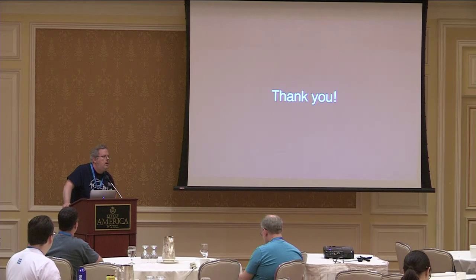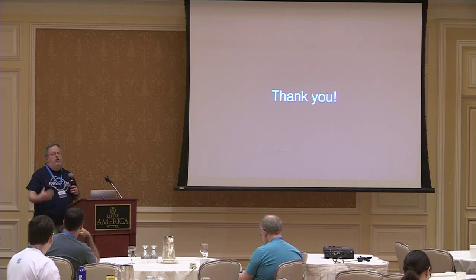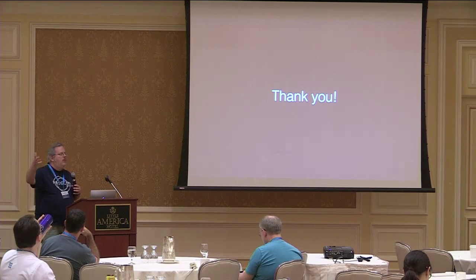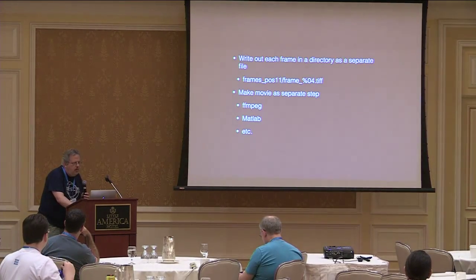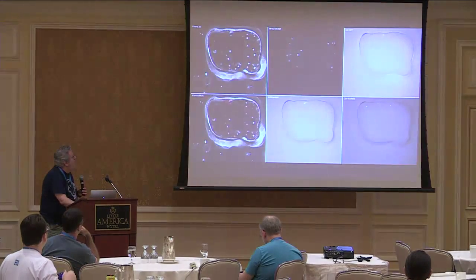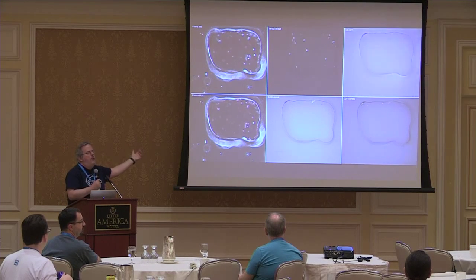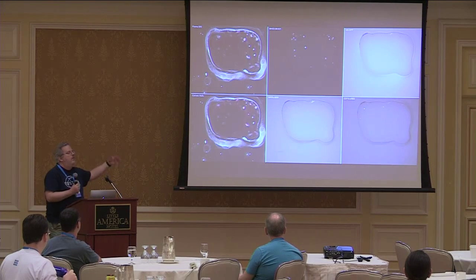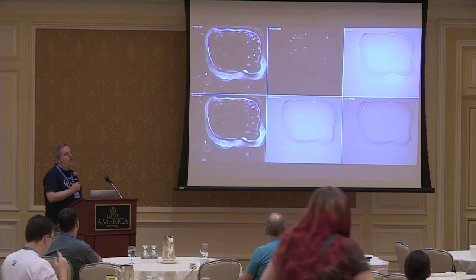Separate what frames? Fluorescent frames. It depends. So the question is, why did they have the separate fluorescent frames? And it really varies by experiment. Those would have been 4 different colors of fluorescent. I think, let me back up. I think it was violet, green. Yeah, they're trying to point out different things. They can get triggered when different things happen. And they're telling different things to the biologists. So we didn't get to a point yet with this where they're telling anything to us.